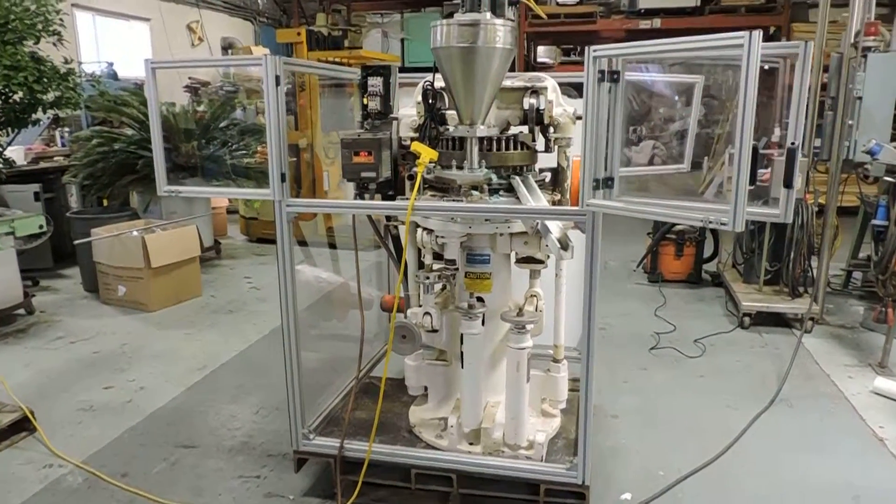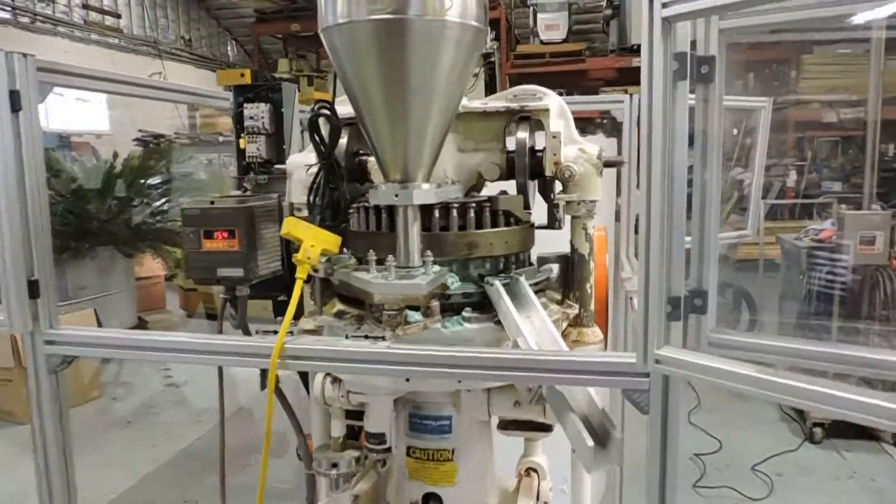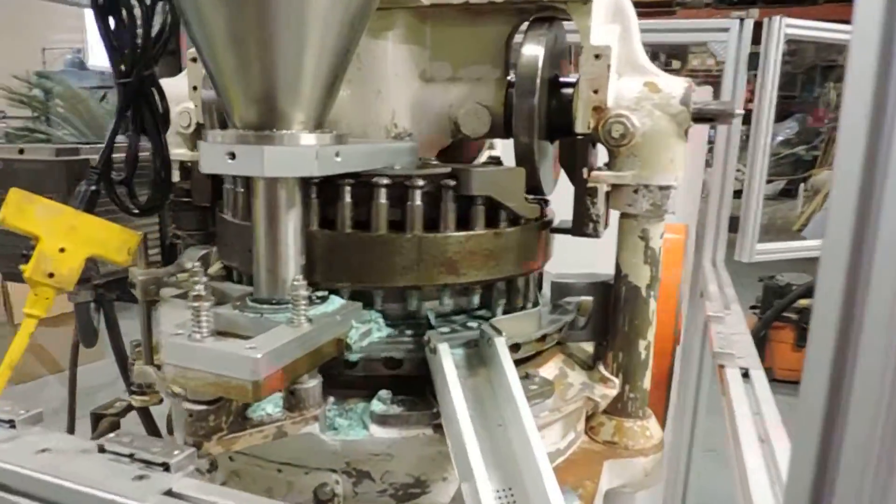Hi, welcome to Champion Trading. What we're demonstrating today is the Stokes 580-2 Tri-Pak Rotary Tablet Press.